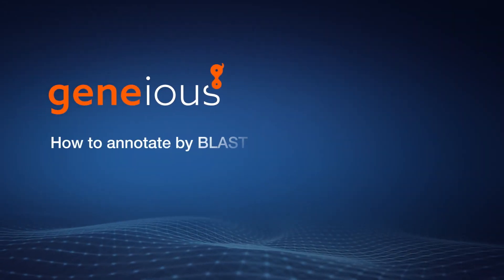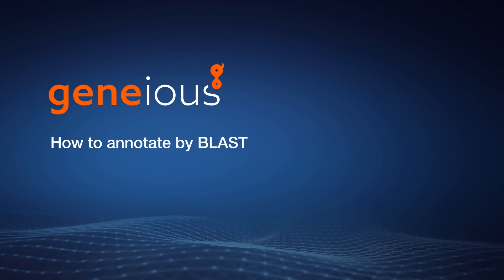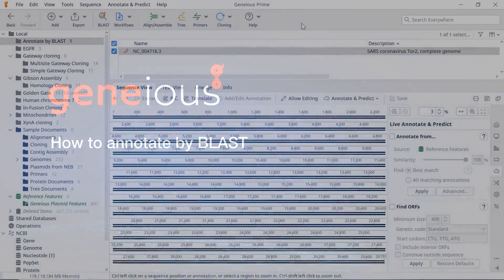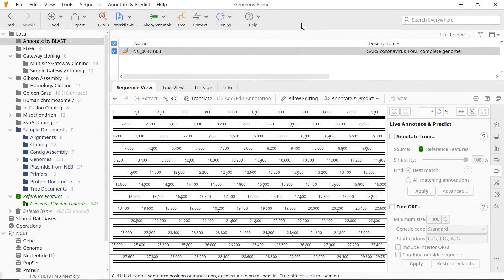The Genius Annotate by BLAST tool allows you to annotate previously identified ORF, CDS, or mRNA regions on your sequence using BLAST.